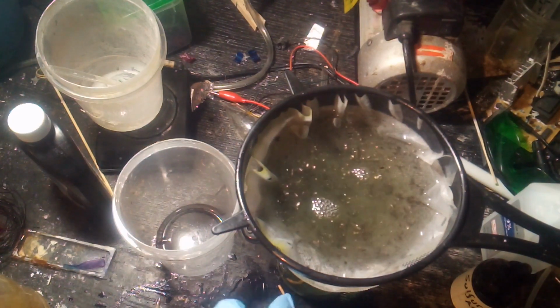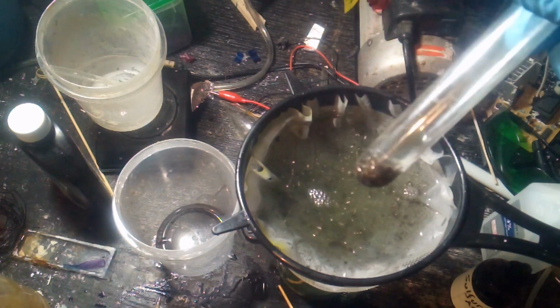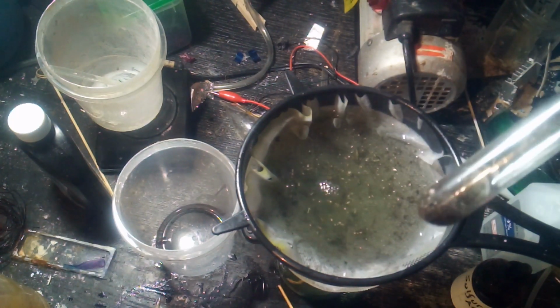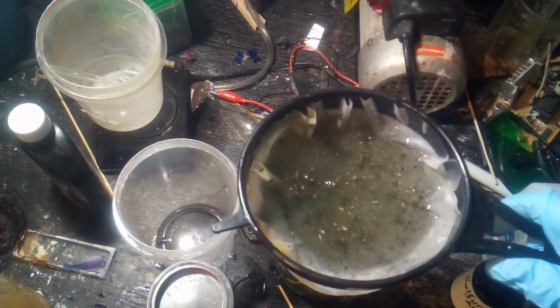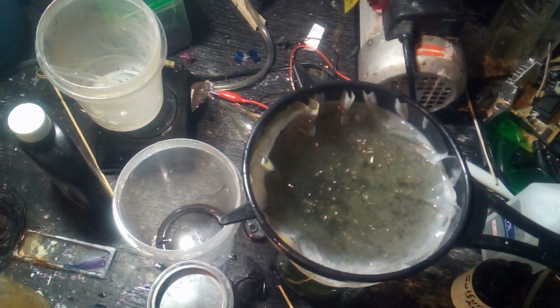So I have everything in the filter, plus what I've collected into this test tube. So I think that should be enough chromium to make a good sample. Besides, I'm kind of tired of smelling hydrochloric acid at this point. And I'd kind of like to be done with this part.